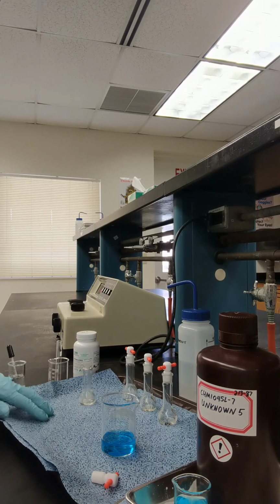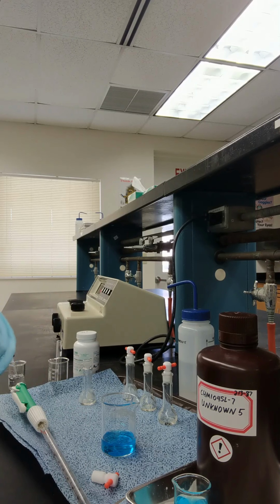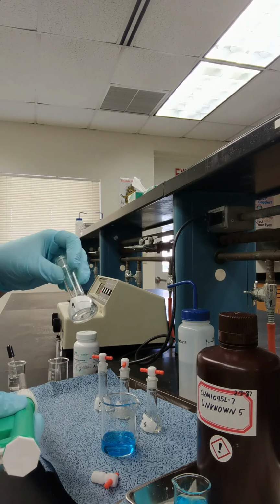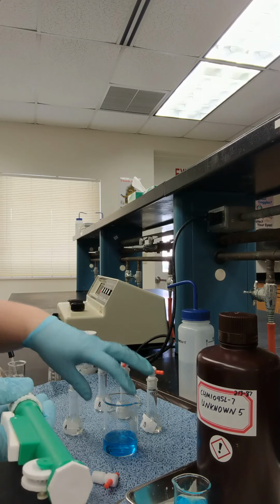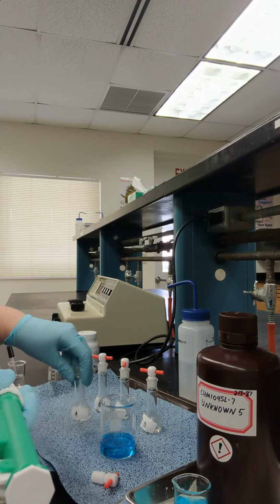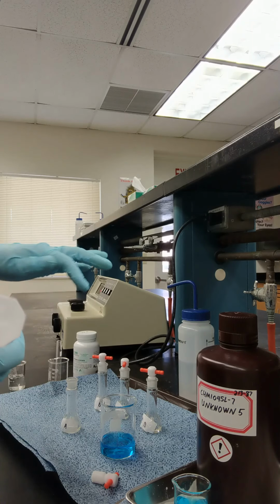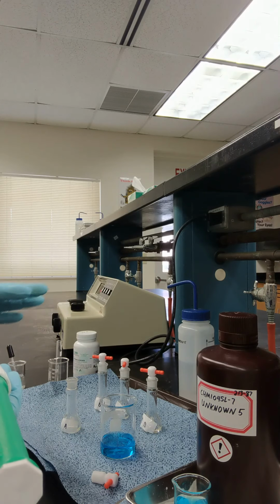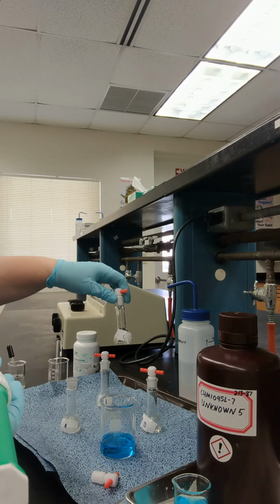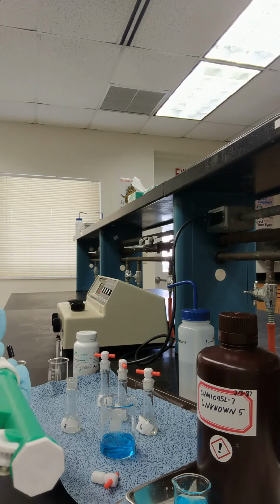So we have to prepare standards A, B, C, and D. You should label your volumetric flasks so you don't get them mixed up. I have my first volumetric flask for standard A, and the volume that I need from my stock solution to prepare standard A is 2 milliliters. So we're increasing the volumes from 2 milliliters to 4 milliliters in the second one, 6, and in the last one, standard D, we're using 8 milliliters.